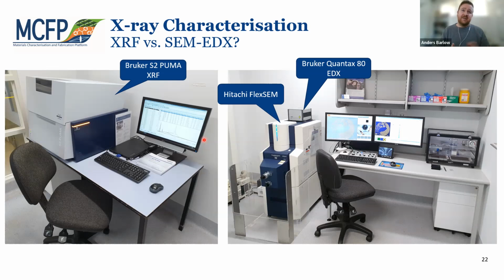And then the last thing, EDX, of course, or SEM in general, you can't work with liquid samples. It is a vacuum technique. So if you want composition of a liquid sample, XRF is your only option between these two. EDX is just not going to work in that particular case. But if you're not sure about the best way to do it, reach out to us and ask the question, this is my sample, this is what I have, what's the best technique to apply to get this particular answer? And we're very happy to help you if we can.